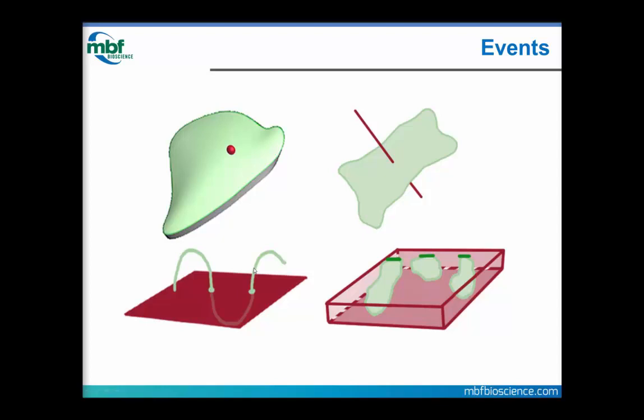If we are probing for the surface of a biological membrane, for instance in the placenta or in the lung, the Stereo Investigator software will generate virtual line segments, and we count an event, which is the interaction of the line segment with the tissue, with the membrane. The more intersections there are, the more surface there is. Today we're going to concentrate on estimating the number of cells in a given anatomical region.